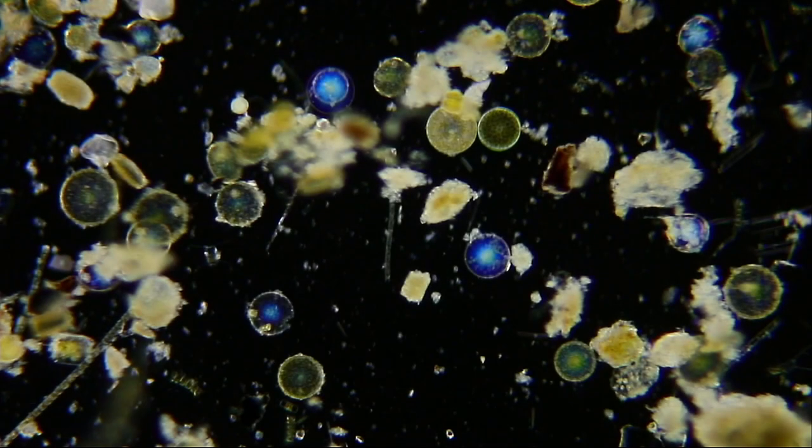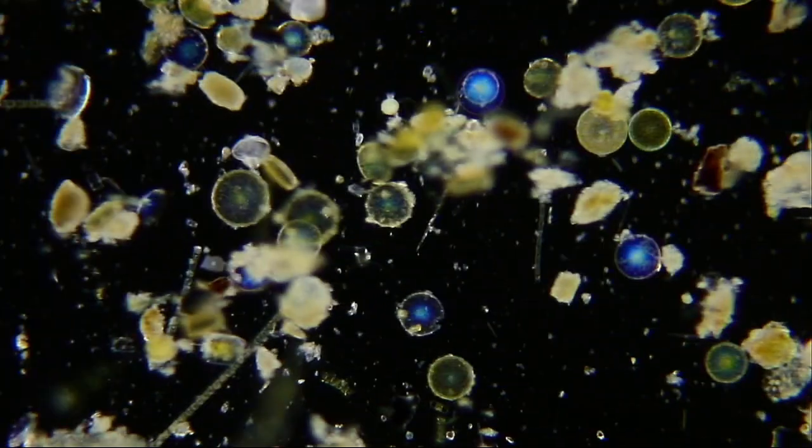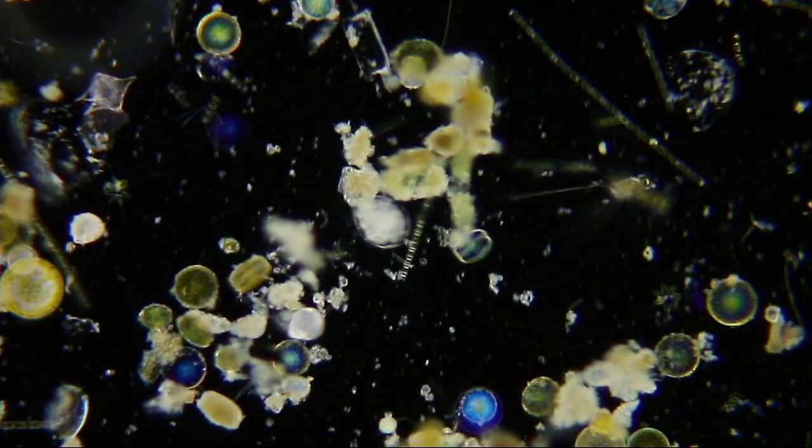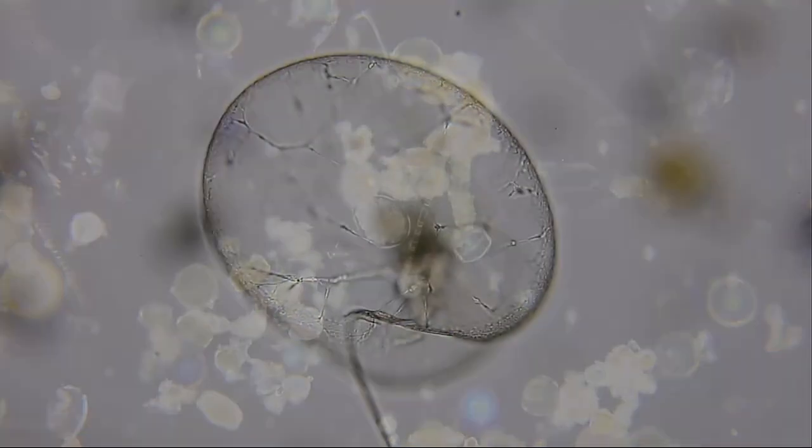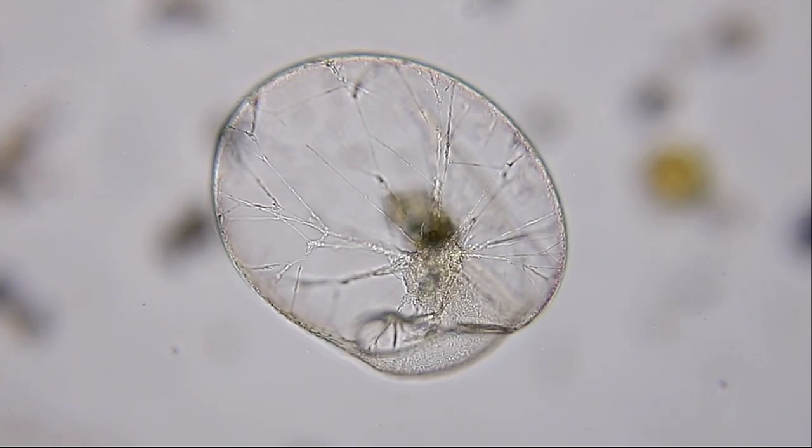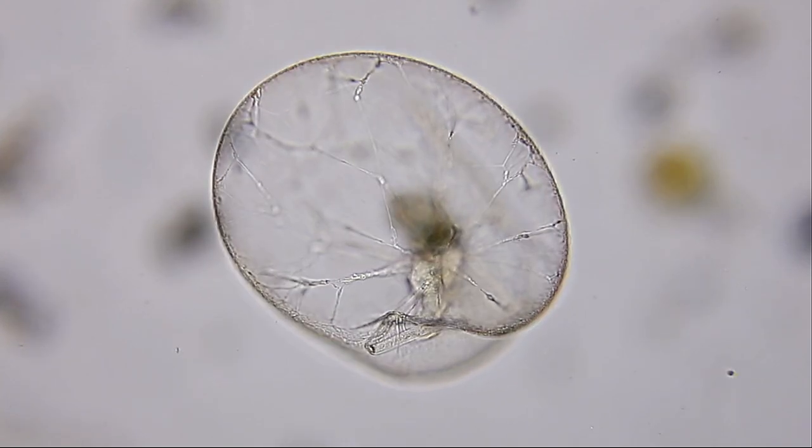Phytoplankton are the plant-like plankton that make their food from sunlight, water, and CO2. Noctiluca, a dinoflagellate, has been present in every plankton sample recently, waving its long tentacle.